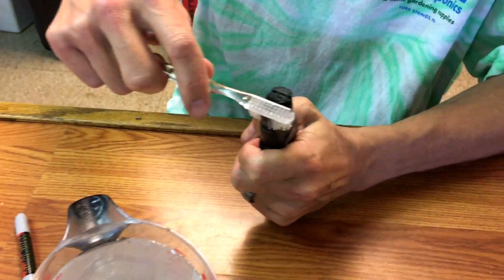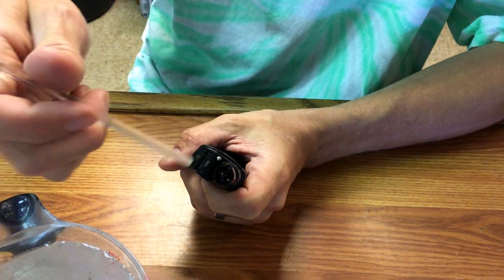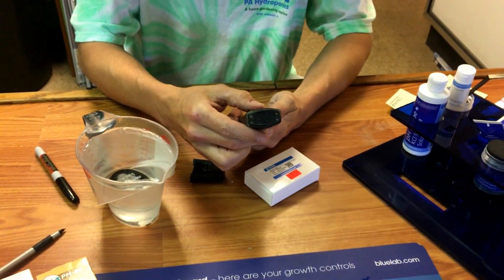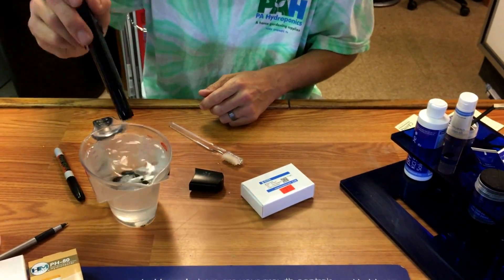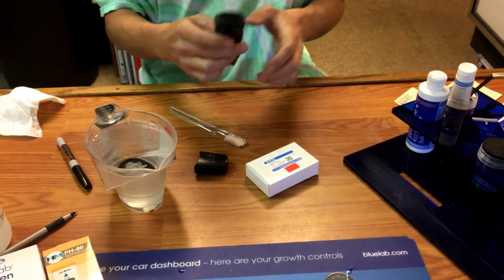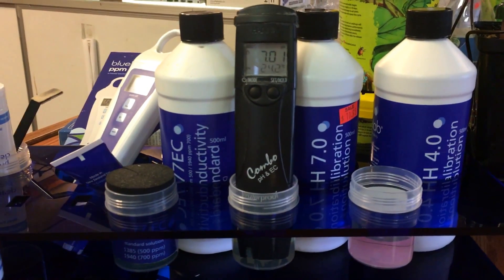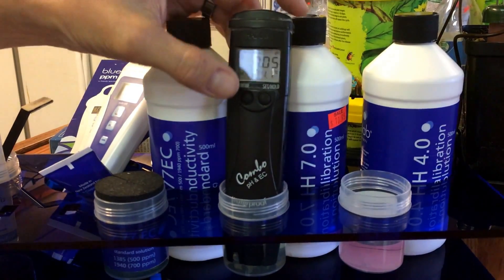Make sure you get all the salt deposits out of there. This is a combo meter, so it actually has the nutrient strength probe right here, then the junction, and then the electrode. I scrubbed the probe very nicely, rinsed it off, and stuck it in the 7.0 solution — and it's very close. So this might have just needed a simple cleaning.